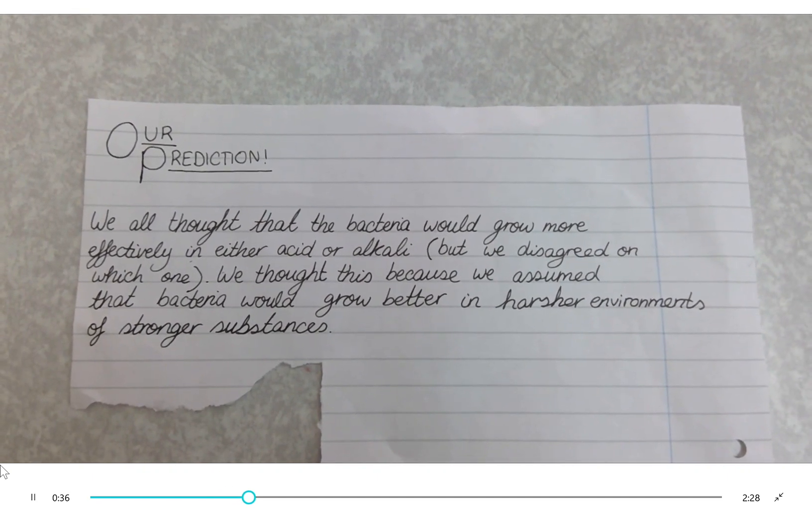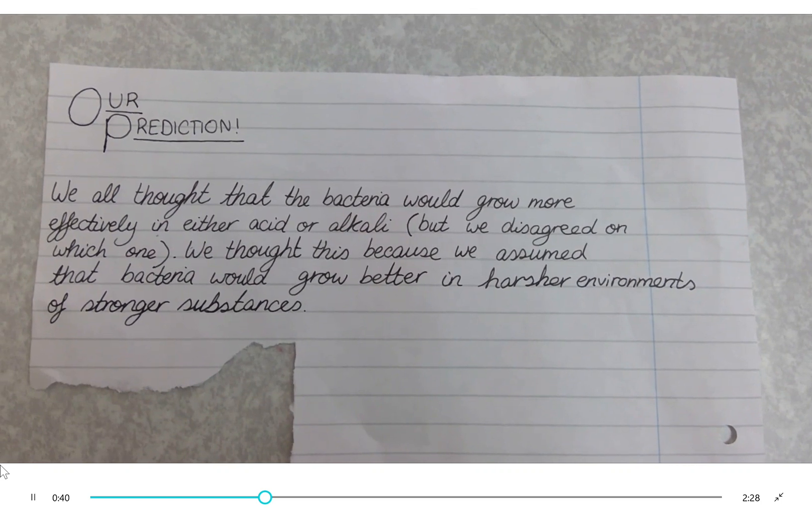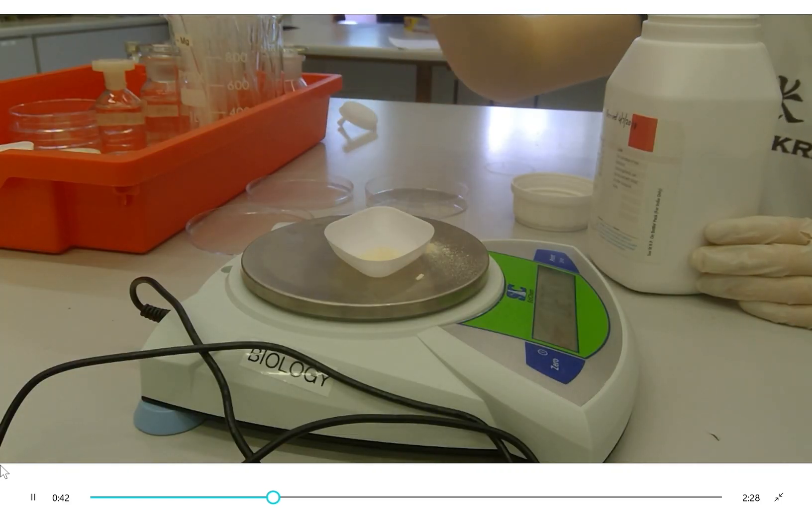First, you add agar powder to a substance. We're using different substances of pH 3, 5, 11, 9, and 7.